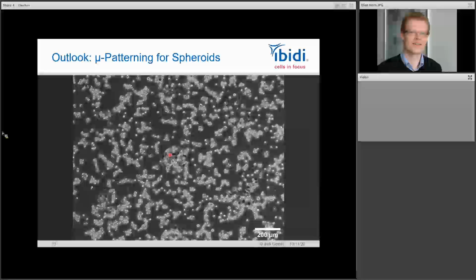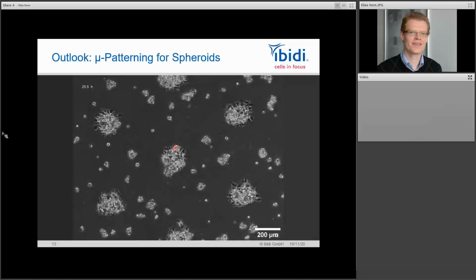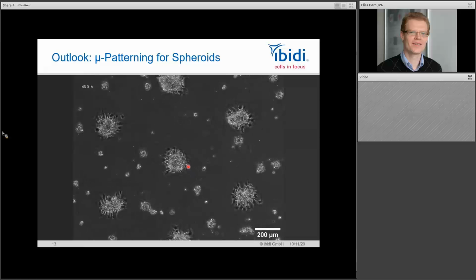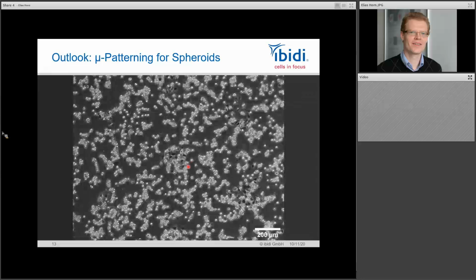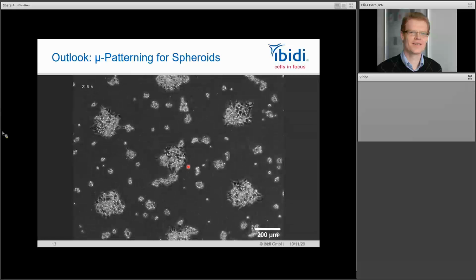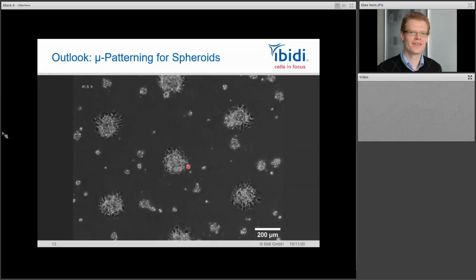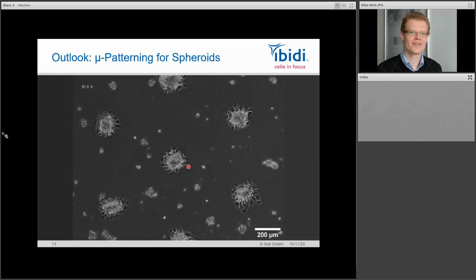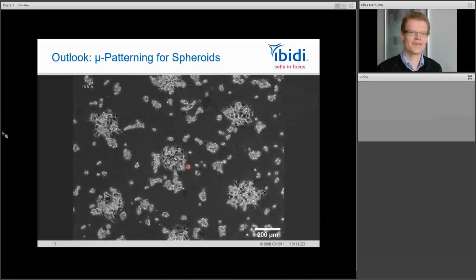And this is the video I just talked about, I just promised to you. So as you can see here, we do have our adhesive spots. And over time, the single cells we just seeded here will collect there, will attach to each other, and will form those spheroids. So this is the application in which we seeded single cells, but we can also seed a suspension of spheroids on those spots, which are created by a different technique, by a hanging drop method, or by any other spheroid creation method.